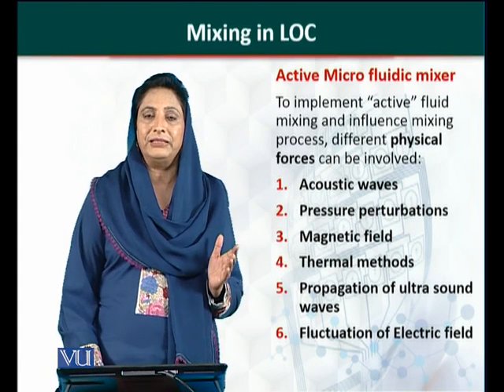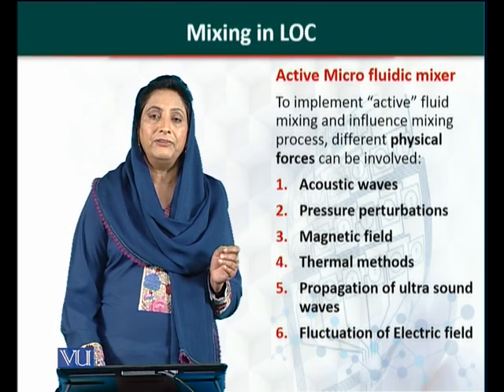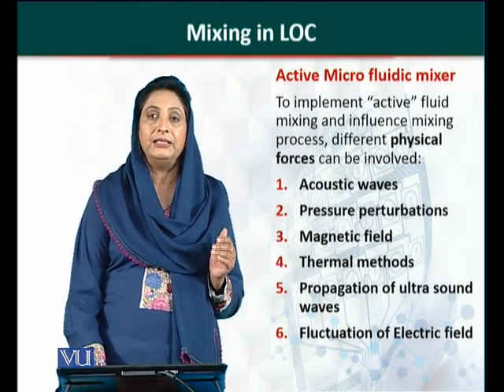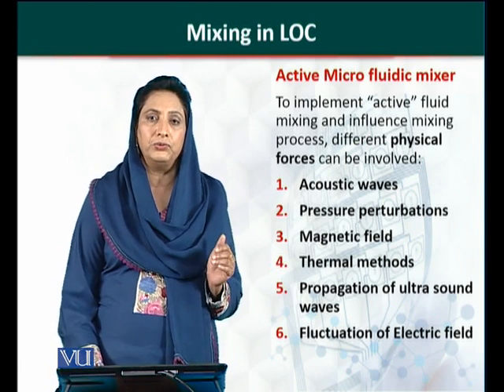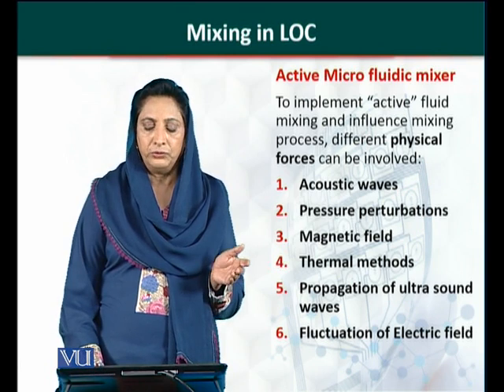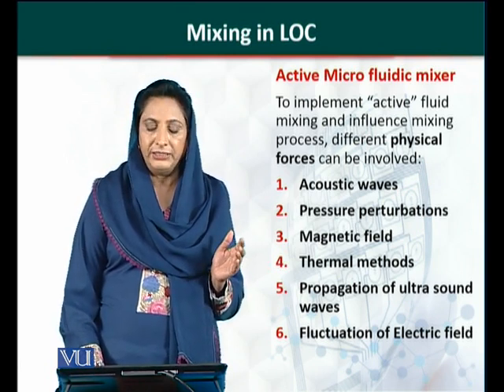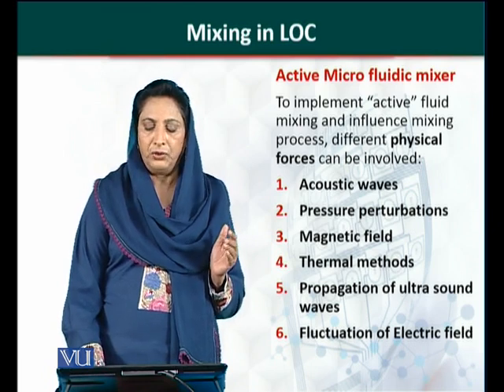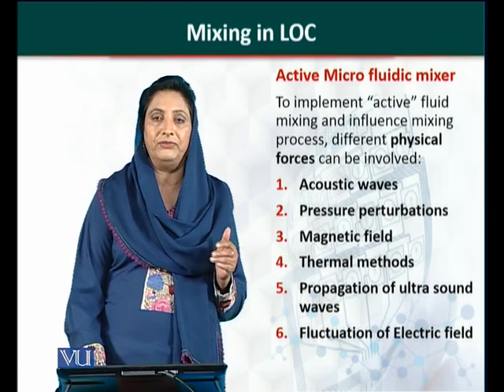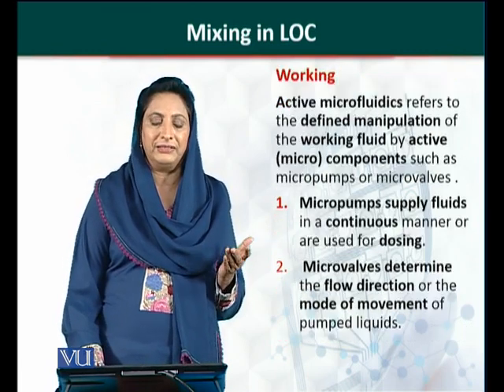अब पैसिव मेथड्स के बाद हम एक्टिव माइक्रोफ्लूइड मिक्सर की तरफ आते हैं. एक्टिव माइक्रोफ्लूइड मिक्सर में हम फिजिकल फोर्सेस का इस्तेमाल करते हैं. And these forces which are used in lab-on-chip technology involve acoustic wave, pressure perturbation, magnetic field, change in temperature, or use of ultrasound waves and fluctuation of electric fields. इन forces को हम इस्तेमाल करके samples को mix कर सकते हैं.